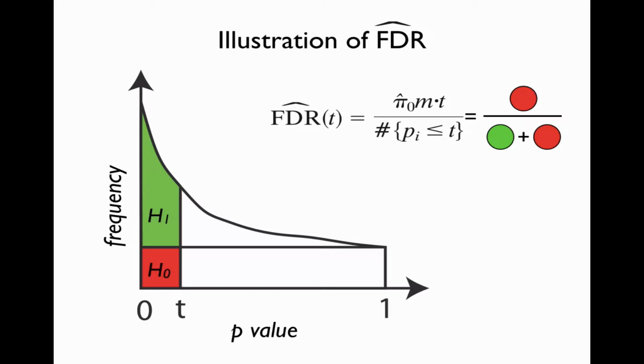So up to this point, I have tried to describe the false discovery rate in terms that don't necessarily involve anything about models that we as mass spectrometrists want to use, such as the decoy model, etc. False discovery rates are just a property of a list with a threshold. As long as you can define a null hypothesis, and you can score your identifications, then there is such a thing as a false discovery rate for that list. Don't let anybody else tell you something different.